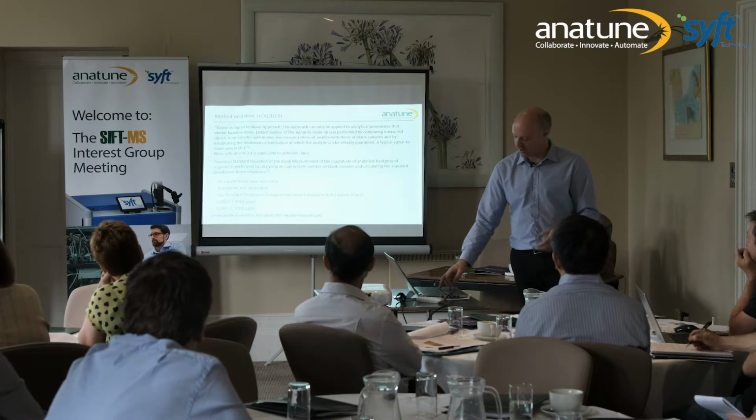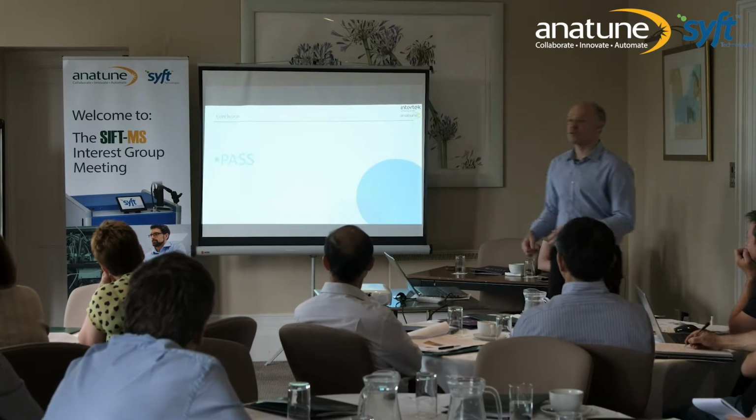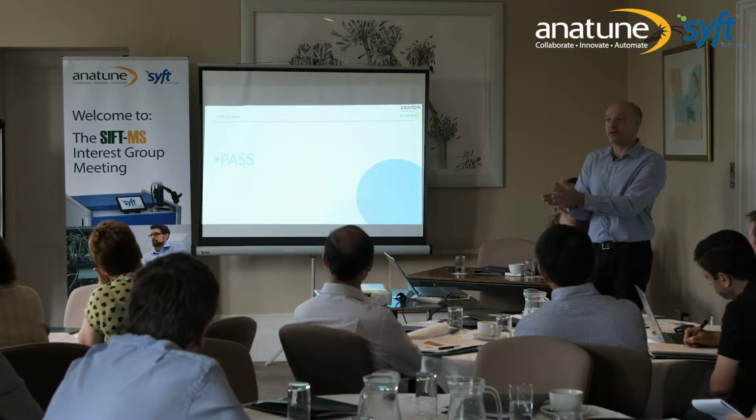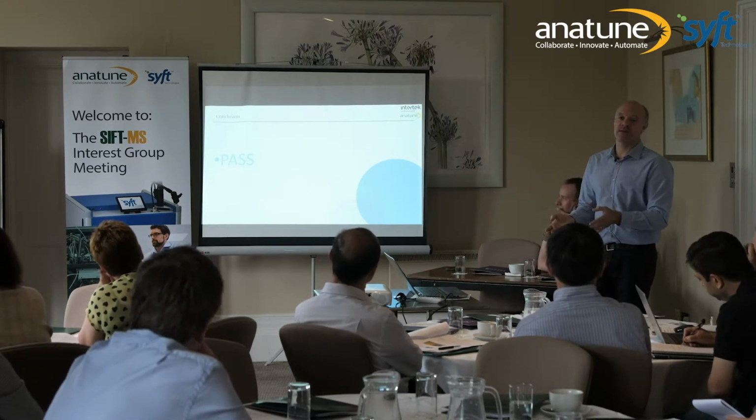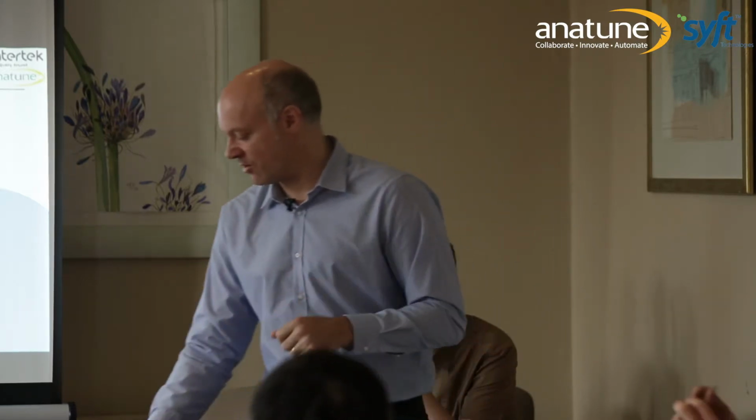So they went through that LOD, crunched all the data, wrote it up, put it through their quality system, and submitted it to the client, who had a look at it, and their summary of the whole method was it passed. So we now actually have a validated SIFT-MS method for a regulatory submission method for a pharmaceutical device, which is quite a bar to cross in terms of an analytical method. It's one of those things that requires a lot of work and a lot of confidence in your system that it's going to work to be able to do this. So I think for that type of method, for that analyte, this is a fantastic result really.